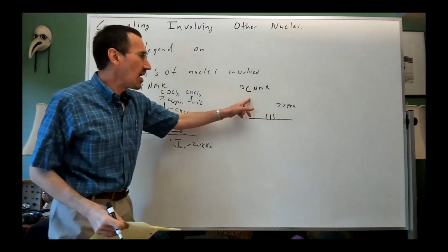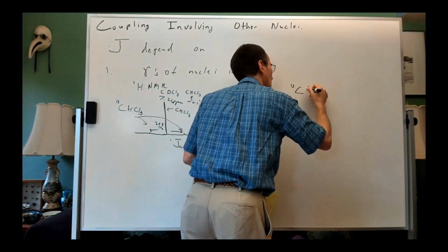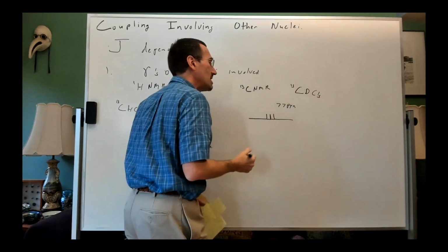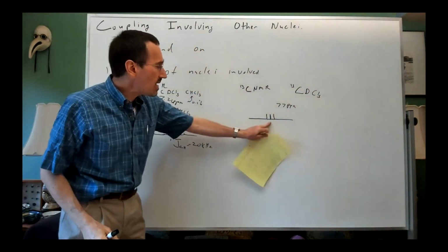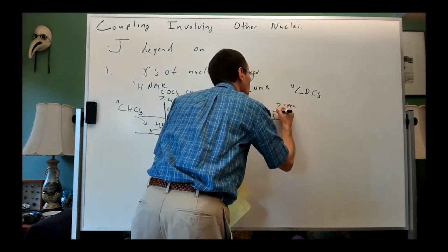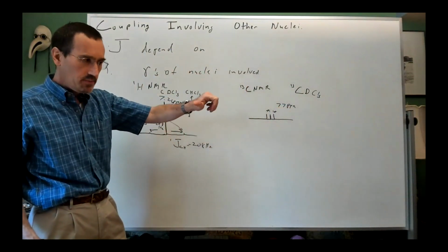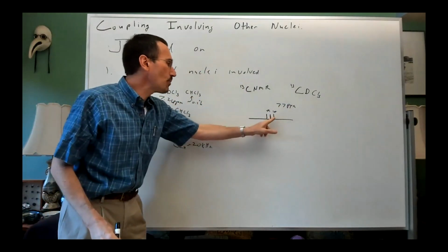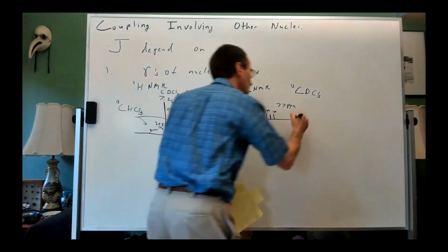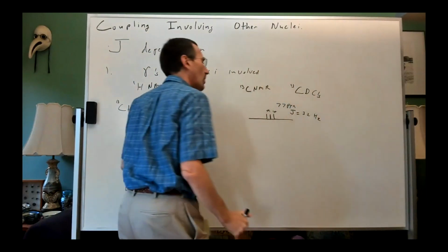That's, of course, from the main part of your sample, C13DCl3, and the separation of the lines then is 32 hertz. That's basically because the deuterium has a nuclear quadrupole. It can be spin up, spin zero, or spin down. And the separation of any lines represents a product of the magnetogyric ratio. And that's J equals 32 hertz for that 1-to-1 triplet.